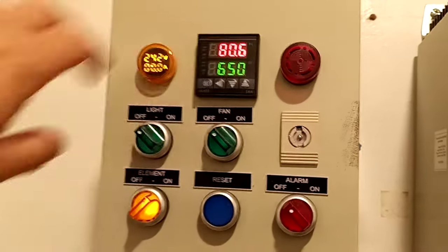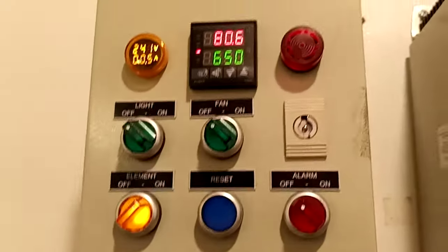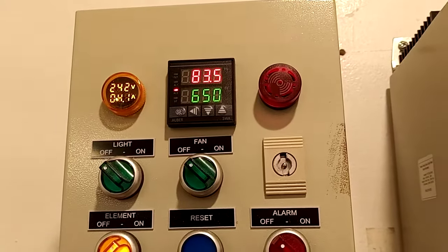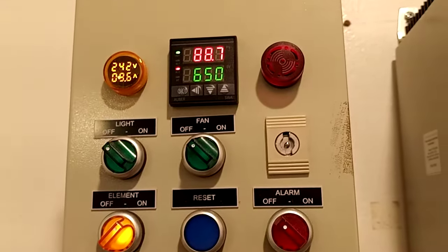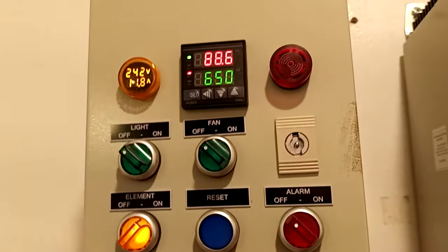Let's turn one on and see how it works. Essentially it's currently showing 80°F on this temperature sensor, and you can see if I hold it it'll start going up from my body heat. The temperature sensor senses the temperature and then it heats up the 220 element down there.